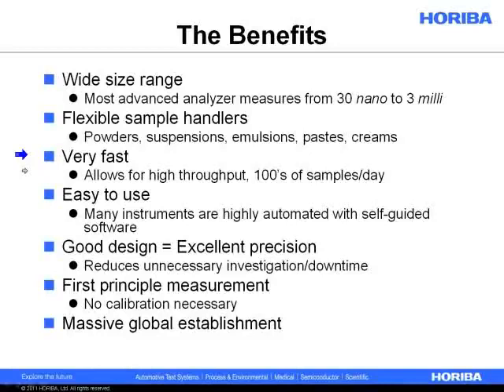But that's sort of a long time scale. If your time scale is only 45 seconds or a few minutes, the modern analyzers now can capture a full distribution measurement in less than 10 seconds. So you can capture some dynamics.